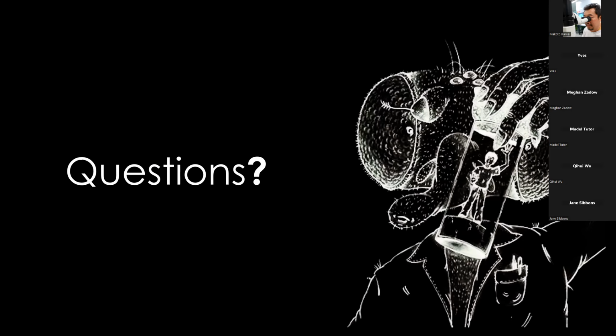But when you use the pan expansion technique, you slice the gel several times because you have several gelation steps. So you slice the excess gel, so it's more difficult. So beads, I don't think the beads would work because, well, they probably won't expand as well as the sample. I don't know what they are made of, but I guess they won't expand to the same extent. So usually it's better to have something in the cell that you know the size of, for example, the nucleus or the centriole or whatever, and then you can measure it before and after.